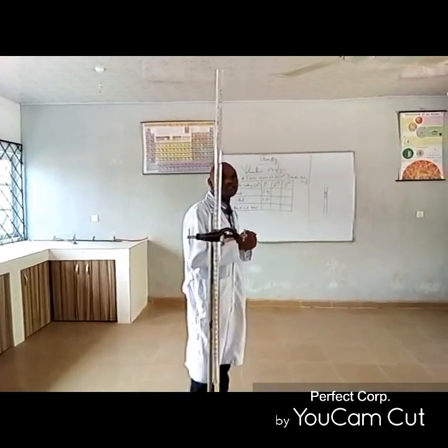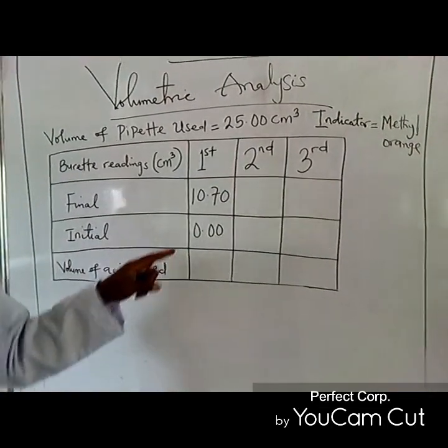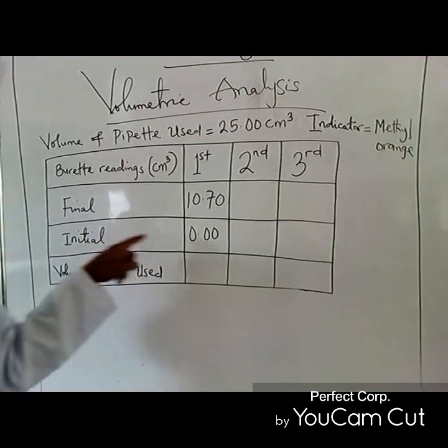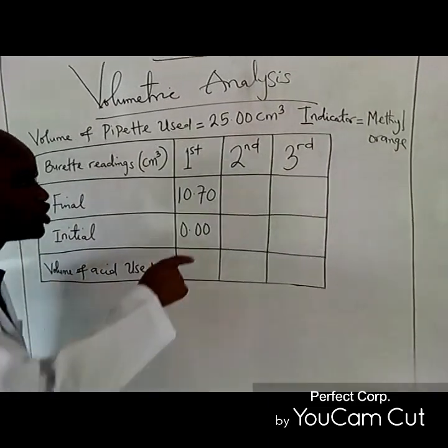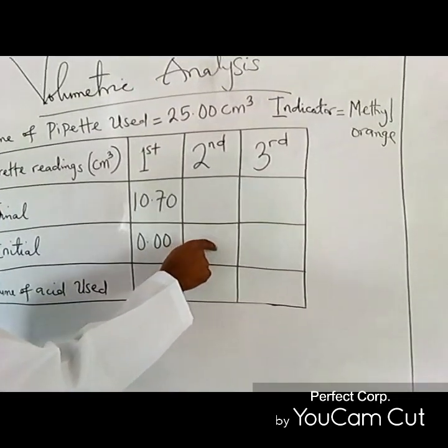Under the second burette reading, for the initial reading, how are you going to know what will be your second initial reading?